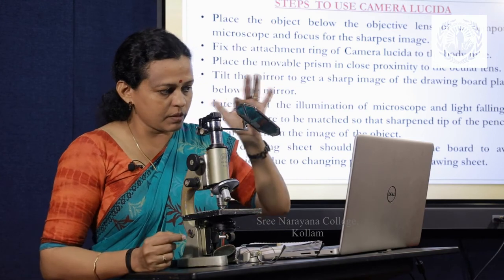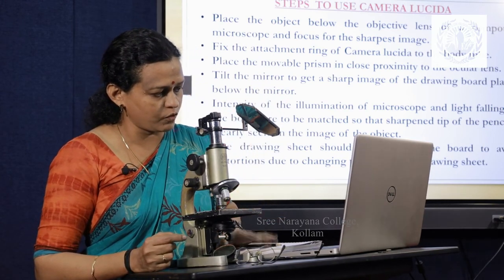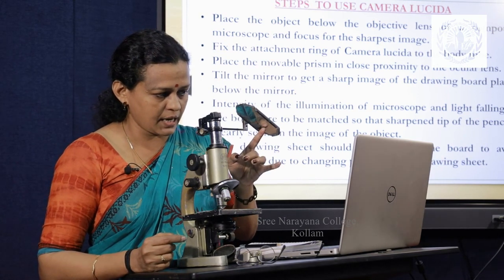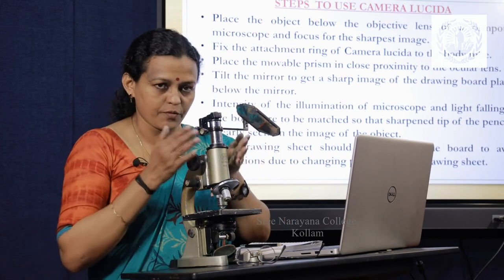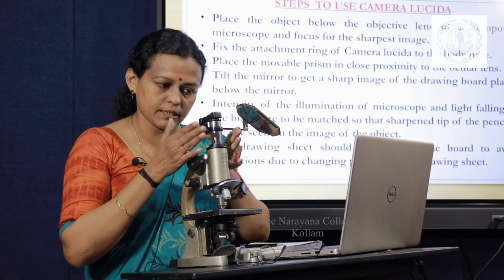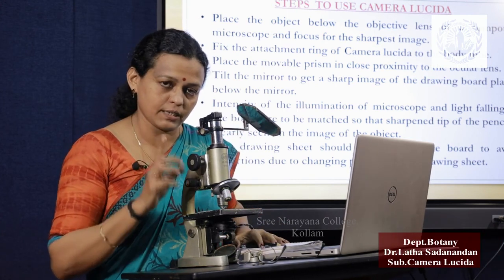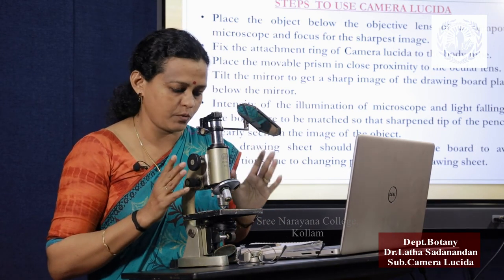I will again explain the principle. The image of the paper is reflected onto the mirror, and from there it is deflected at 90 degrees to the prism. From there, again at 90 degrees, it gets to our eyes. So it is deflected at 90 degrees two times. That is the working principle of Camera Lucida.